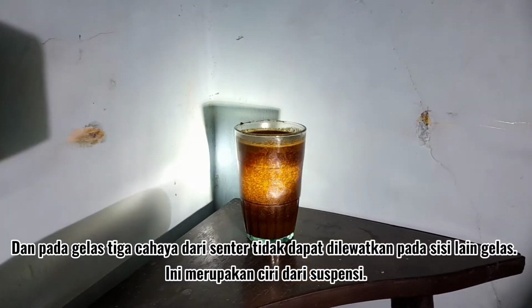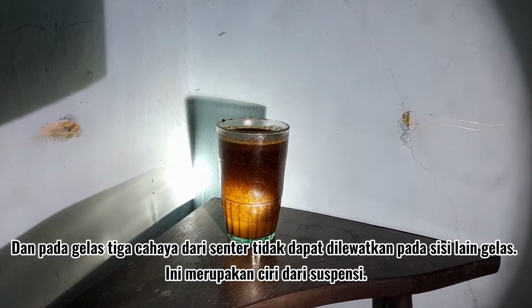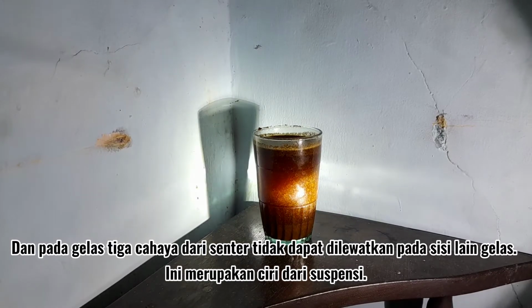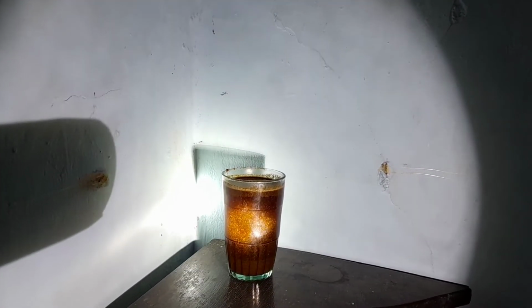And in glass 3, the light from the flashlight cannot pass through to the other side of the glass. This is a characteristic of a suspension.